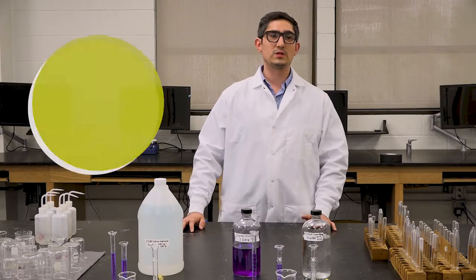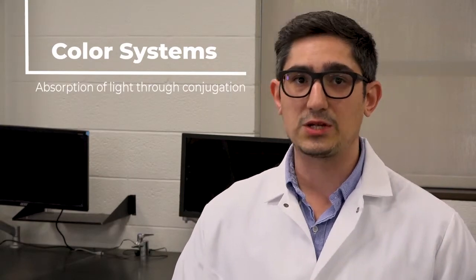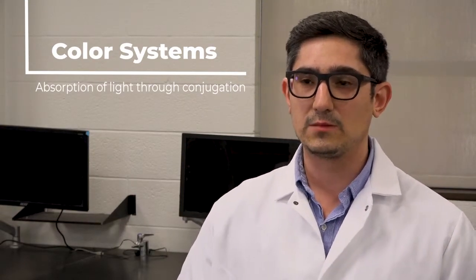So today we're going to be using the lambda max, or the maximum absorption, to track concentration changes. We're going to be looking at colored systems, which essentially is the absorption of light through conjugation. So typically conjugated systems are going to be an alternation of single and double bonds. If that conjugation, or the order in which the single bonds and double bonds are orientated, is disrupted, we'd no longer absorb light in that specific spectra.